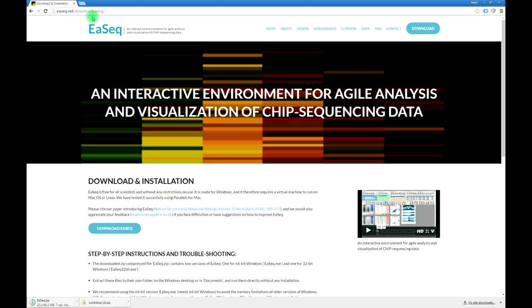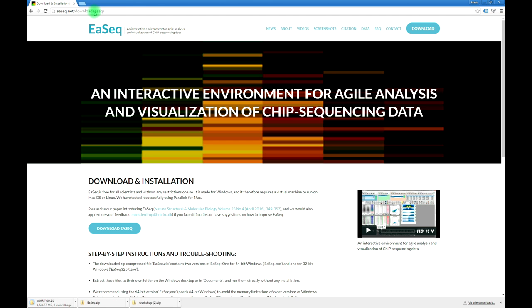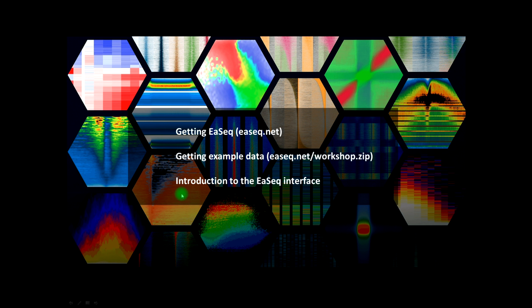And while that downloads, I think we should also download a set of example data. You can get that by typing EASEQ — E-A-S-E-Q dot net — and then workshop dot zip. Use small characters only. That will download some data that you can use for playing around. It might take a couple of minutes to download that file depending on your connection and the distance.